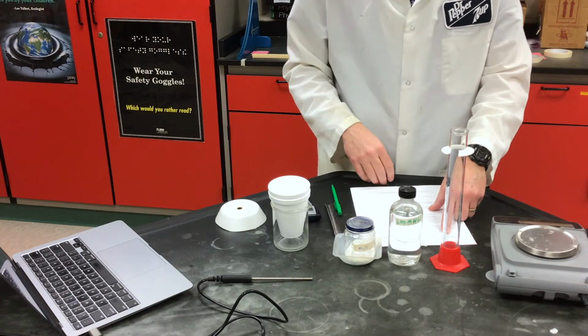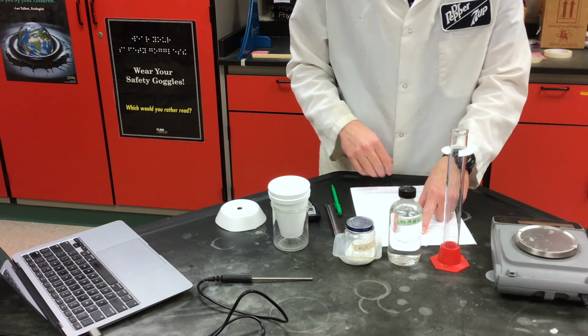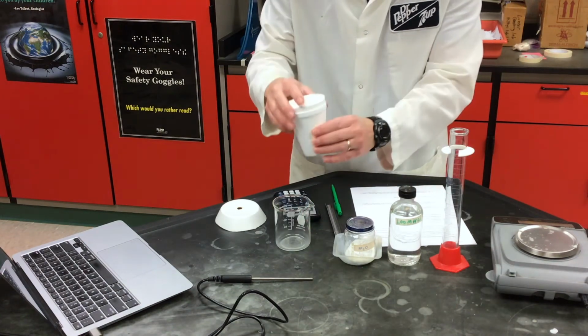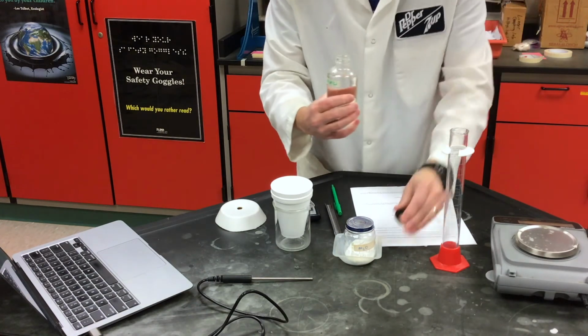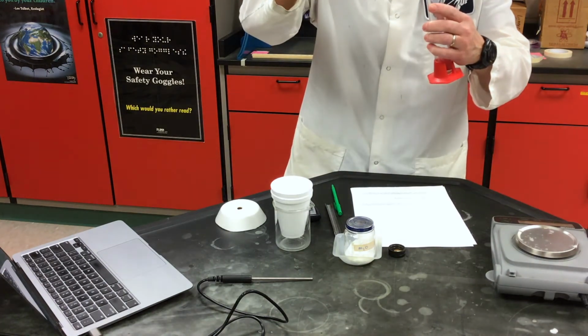It says transfer 50 milliliters of 1.00 molar hydrochloric acid to the calorimeter. Here's my calorimeter. Again, styrofoam cups, very insulated. I'm going to take my 1.00 molar hydrochloric acid. It says 50 milliliters, so I'm going to measure 50 milliliters.